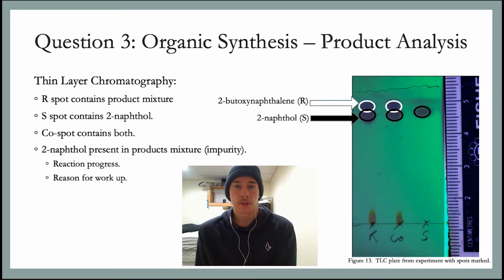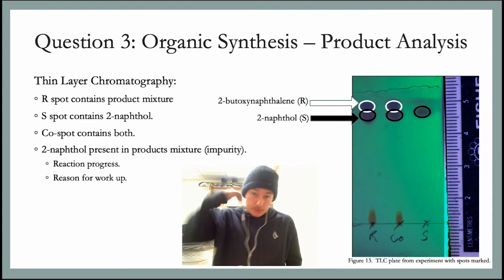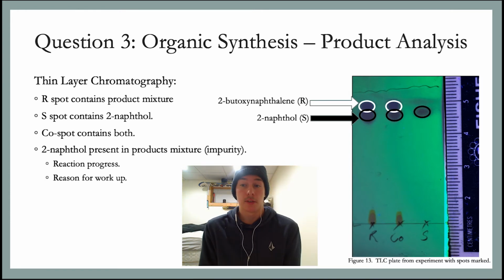So next, we're going to look at a product analysis of all the data collected from the organic synthesis experiment. First, we'll look at the TLC plate obtained from the experiment. The plate was spotted using the product mixture on the R spot and the reactant 2-naphthol on the S spot, and then a co-spot containing both. I've marked the spots in the picture of the TLC plate, and you can see that the R spot and the co-spot look identical. So this is indicating that the product mixture contained leftover reactant 2-naphthol.